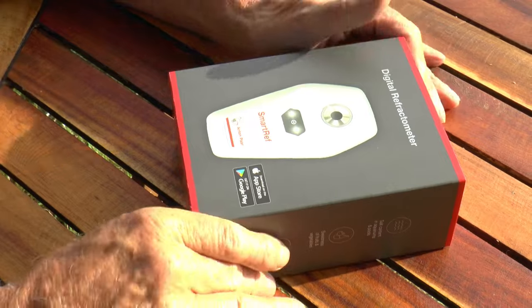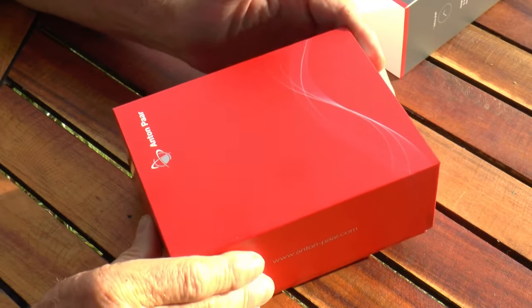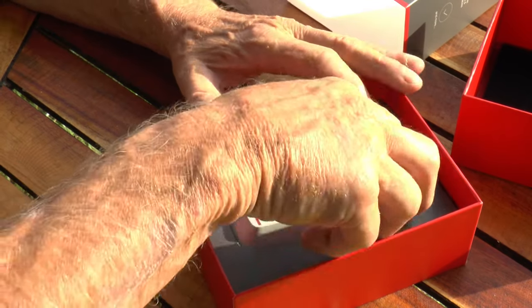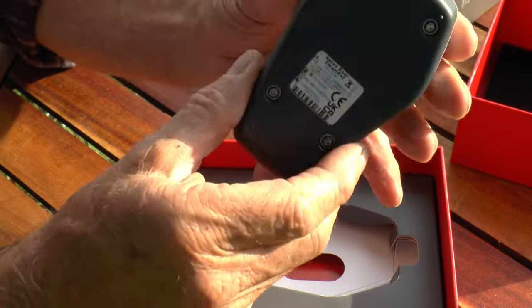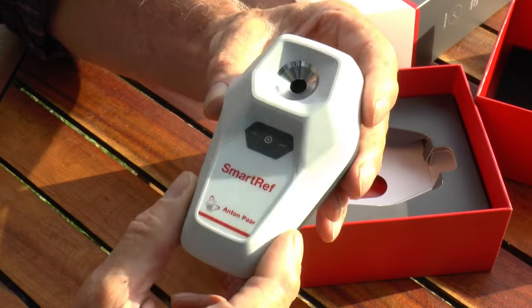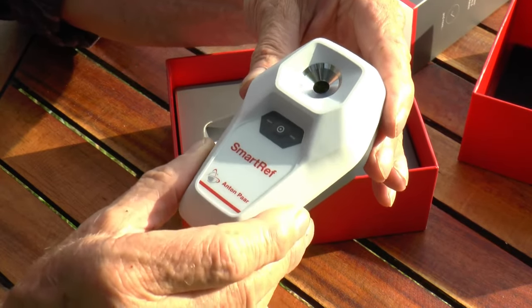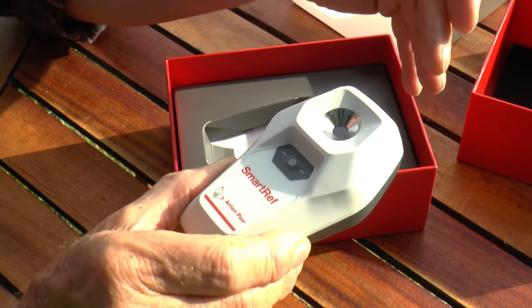As a rule I don't do unboxing videos — I mean, this is the 21st century after all — but just for this once I'm going to show you the box and the contents of the box for this refractometer. Here's the box it comes in; it's a very nice box and the sleeve slides out in a predictable manner. We take the lid off and inside is the SmartRef digital refractometer. It's got a handy little hole at the top where I can withdraw the instrument, and you can see that it's very well made — it's a very solid little thing. The device itself is robust, well made, and pretty much waterproof to a high standard, so it's going to withstand reasonable rough handling. But honestly, this is a scientific instrument, so I wouldn't throw it around. It's extremely accurate and it needs to be kept clean to maintain its accuracy.